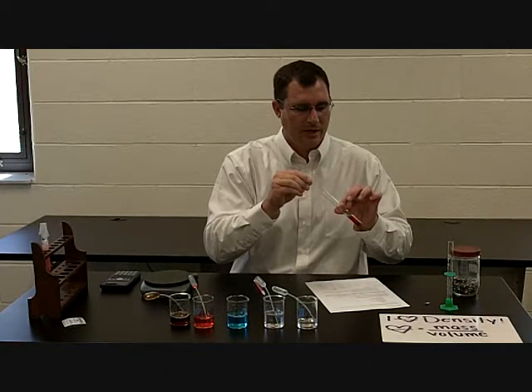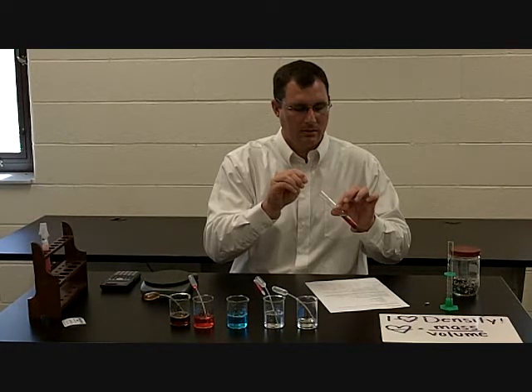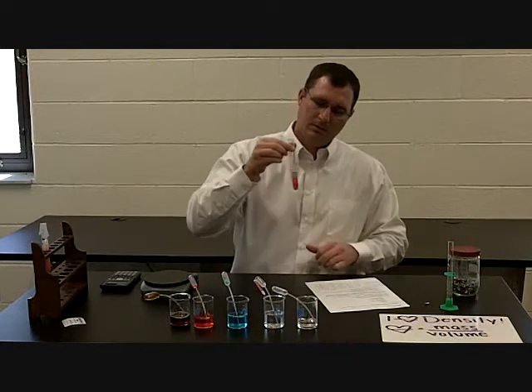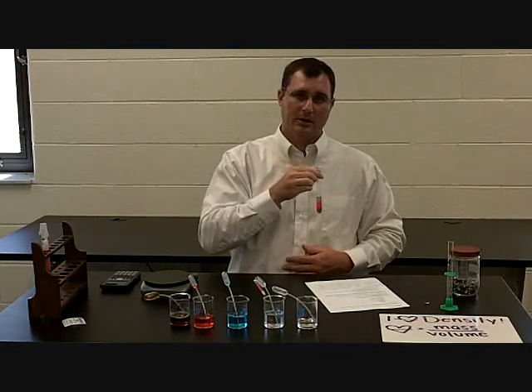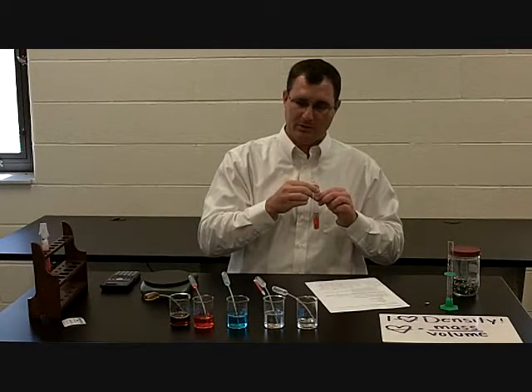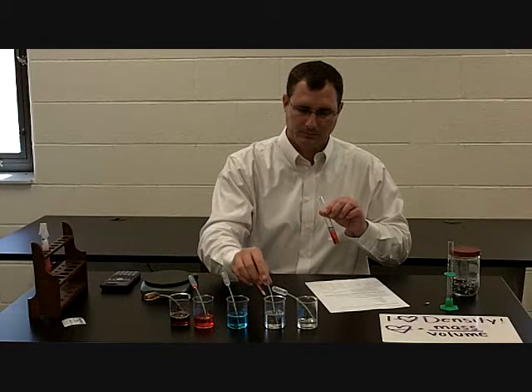I'm going a little fast for the video, so I may not. Let's see. Oh, that's pretty good, isn't it? I got a nice blue layer there, followed by a nice red layer, and my nice brown syrup at the bottom. Let's go with the mineral oil.